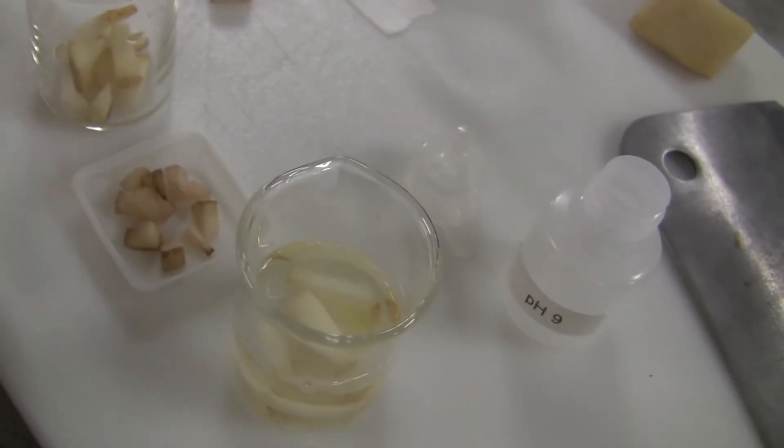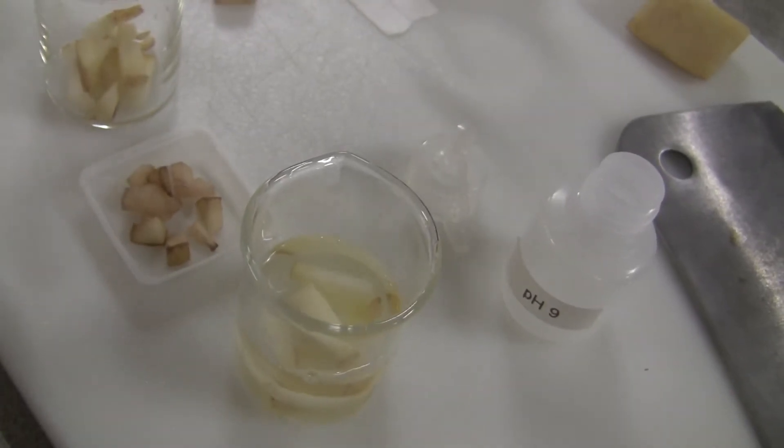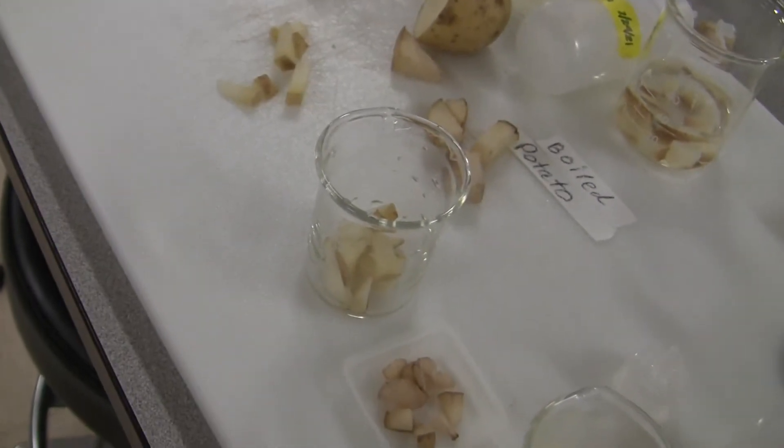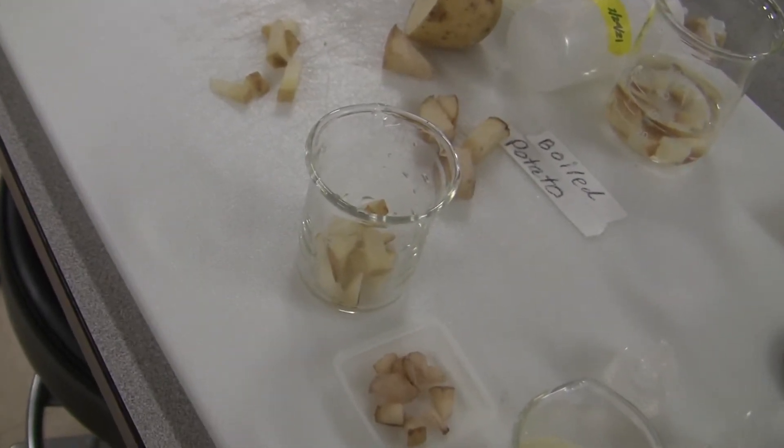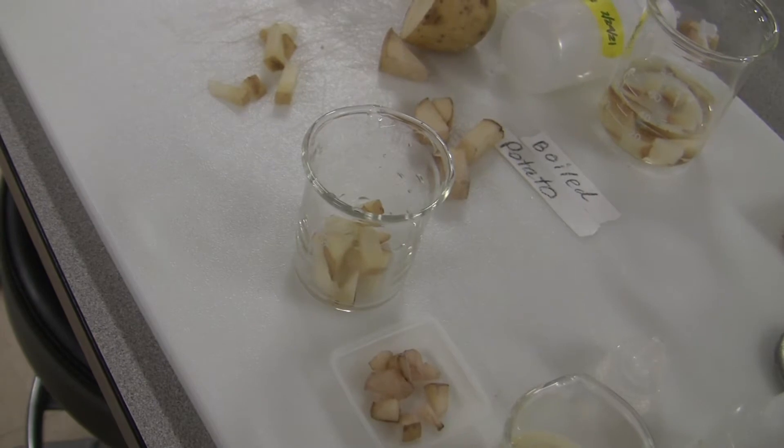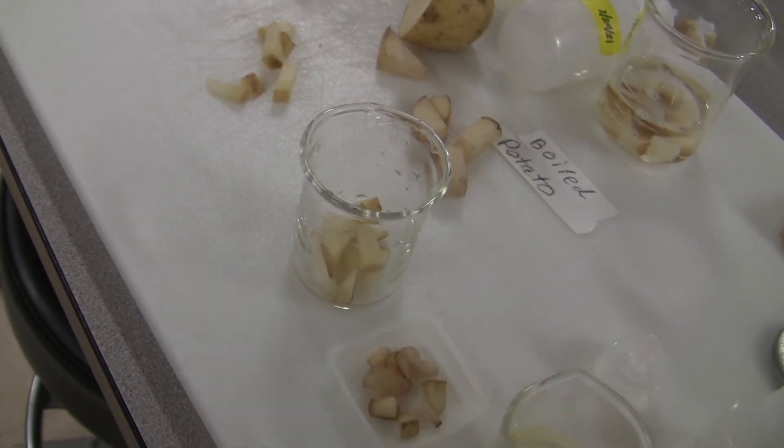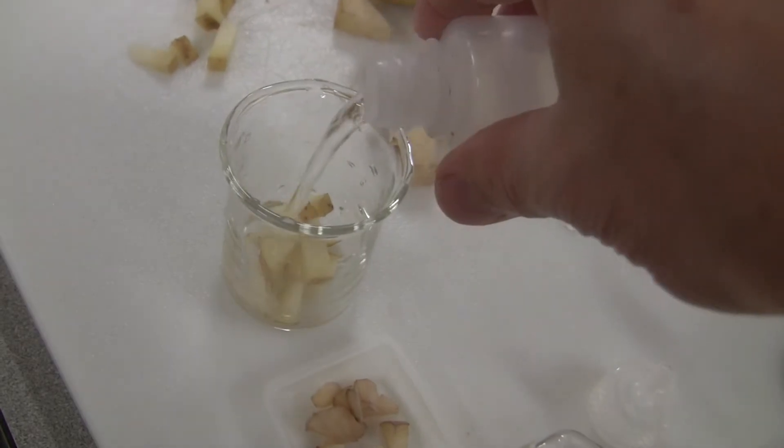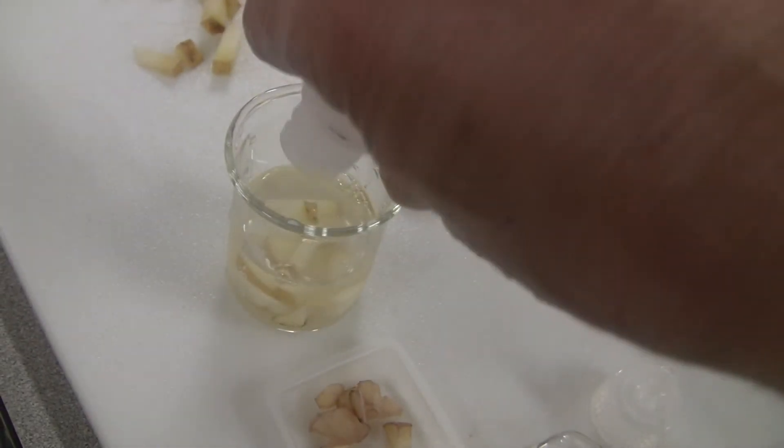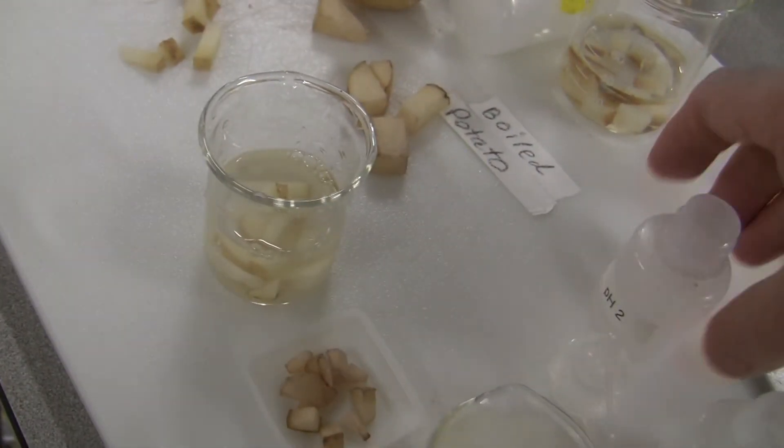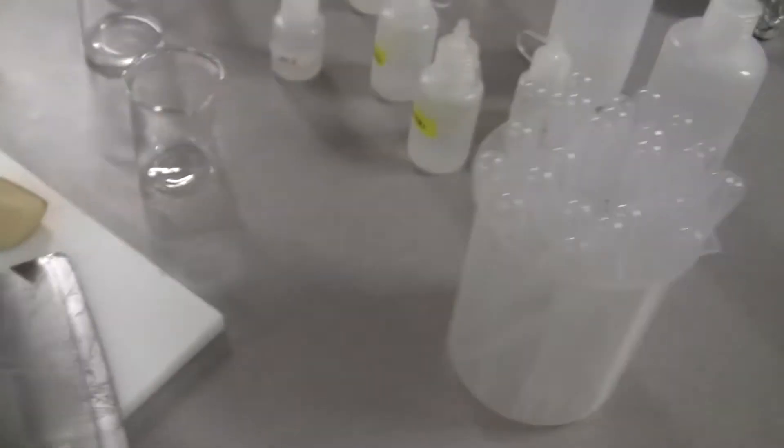And then this one, pH of 2, very acidic. That one was very basic and then this one is very acidic. Again, they both have equal amount of potato. So here is one. And then after a while, after a few minutes, I'll wait and add hydrogen peroxide.